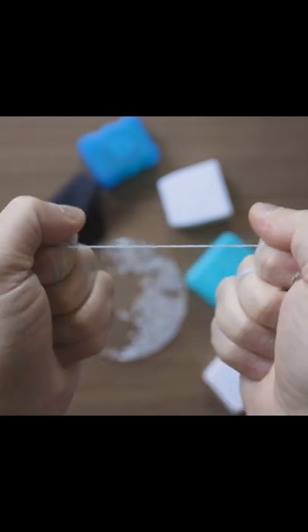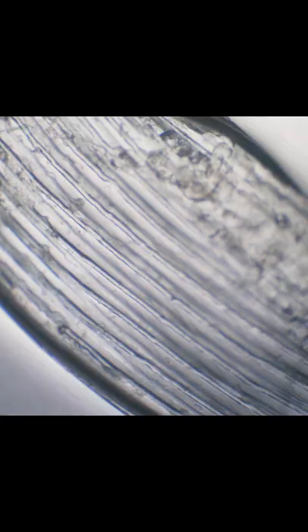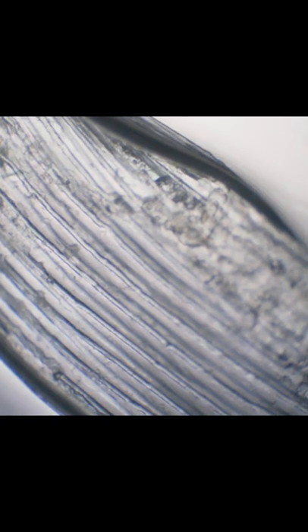Dental floss is designed not to snap. It can only be cut at the correct angle, and if you pull it wrong, you can see the individual fibers. Let's look at these fibers under the microscope. These fibers are so strong.